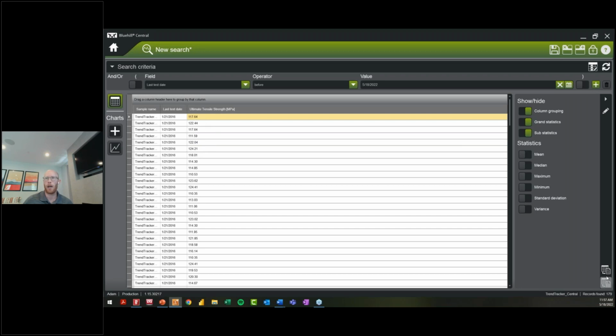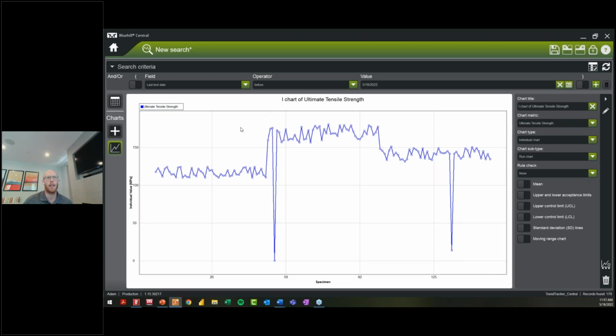Number one, those exporting options that I showed you. Number two is the ability, when you look at a chart that you care about, just like you can export the data of the table, you can export your chart. You can save it, copy it, print it out, or simply copy this and send it off. But there's not a formal reporting mechanism that organizes everything. But again, that's a great feature request that we can use to enhance the product in the future.